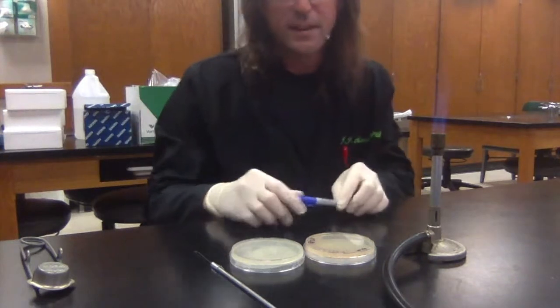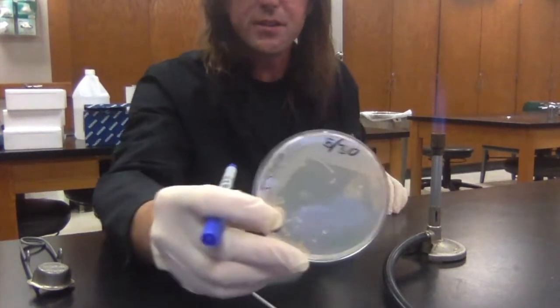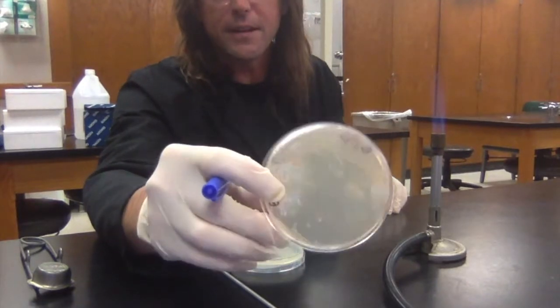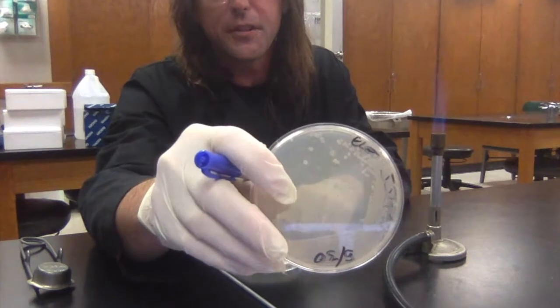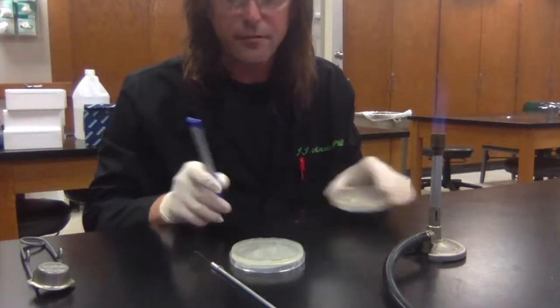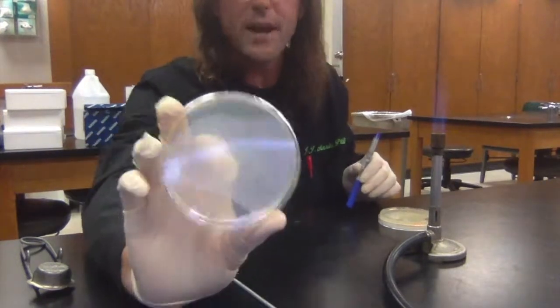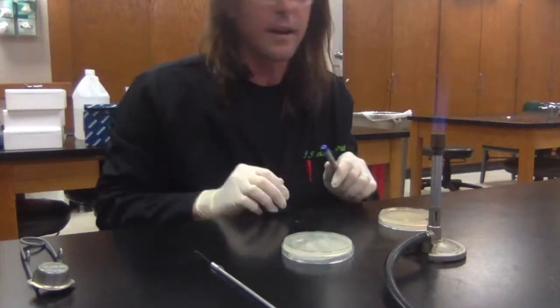In front of me I've got one petri dish which already has bacterial colonies on it — you can see little individual dots of bacteria growing on it. This is the plate I'm going to be inoculating from. I also have a fresh un-inoculated petri dish with nothing on it, so this one's sterile right now.